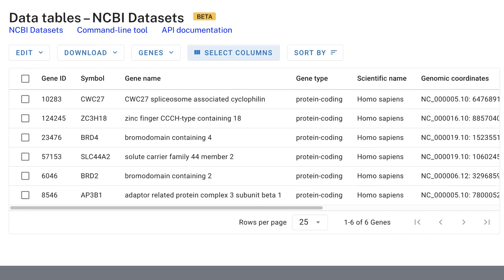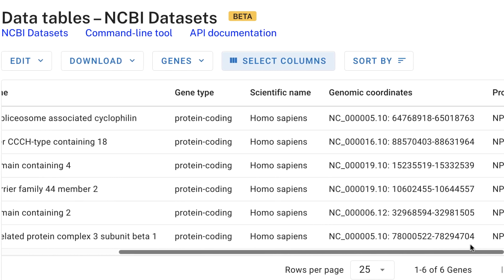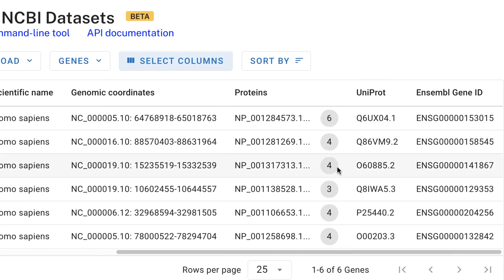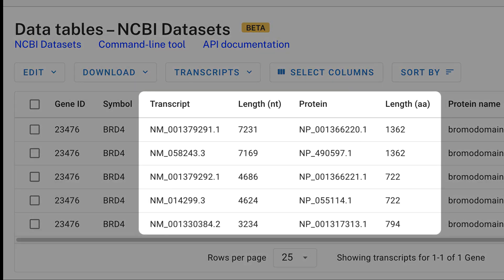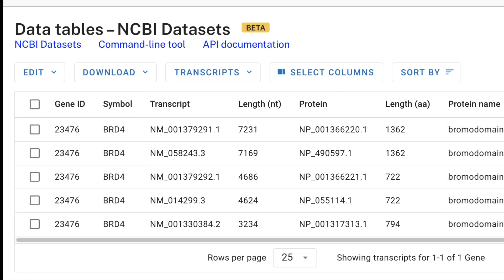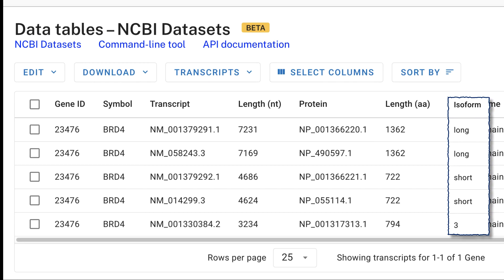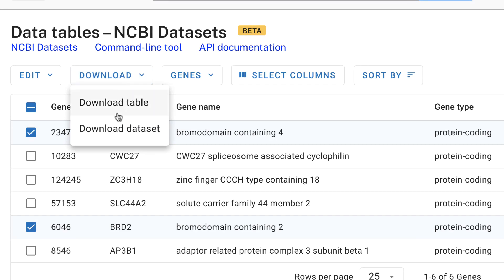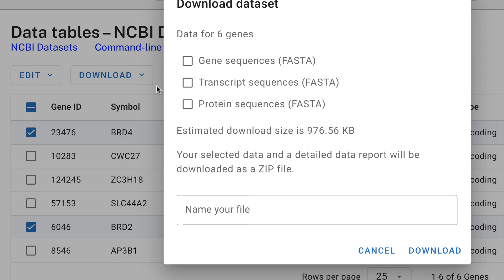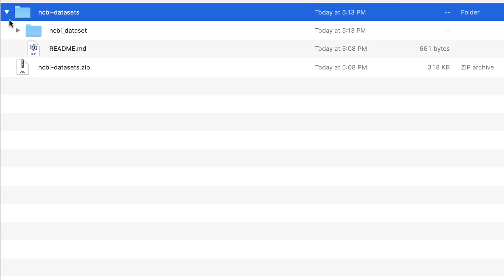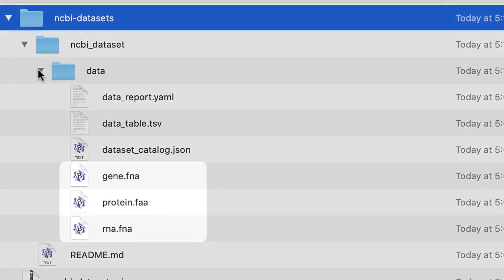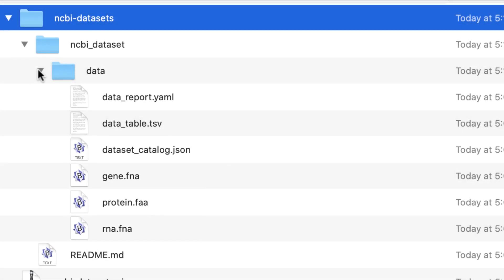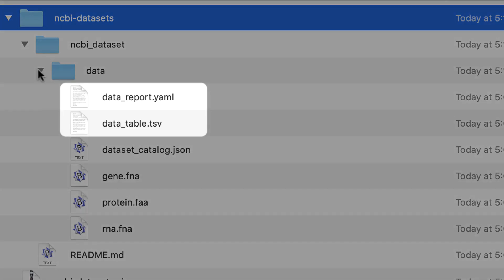If you want more information about the proteins encoded by a particular gene in the table, in the Proteins column, click the circled number to switch to a transcript and protein view. For BRD4, this shows you the transcript and protein lengths, and it associates the accessions with the protein isoforms. Going back to our six envelope gene interacting proteins, I've selected just the BRD4 and BRD2 genes, and will download a dataset containing the information in the table plus the sequence and annotation for those two genes. The dataset is downloaded as a zip file that contains gene, RNA, and protein sequences, and metadata and annotation described in two files: the data report and the data table.